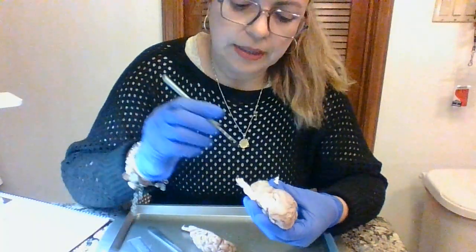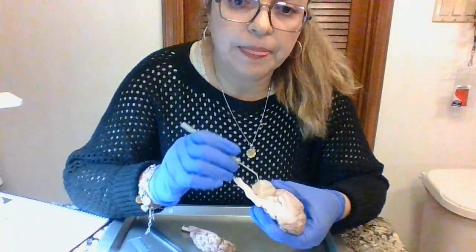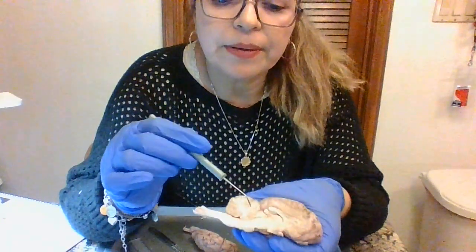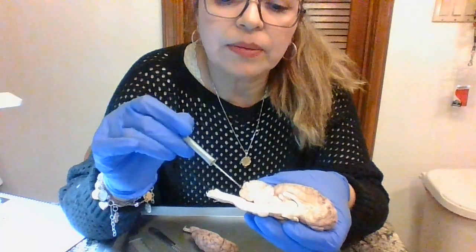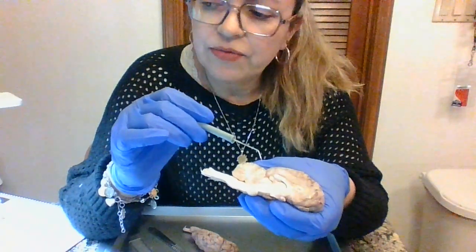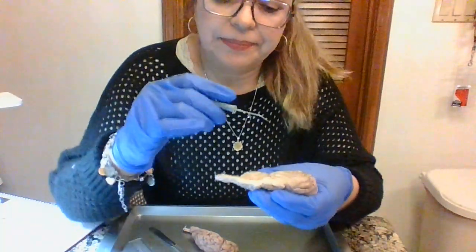Next we have the cerebellum cortex, which is this part. This part is called the cerebellum cortex. The cerebellum cortex coordinates voluntary muscle movement and maintains balance.